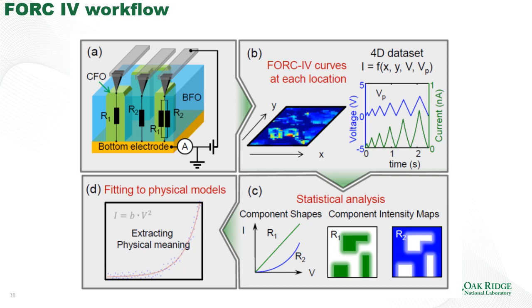So as machine learning and linear unmixing tools progress, we can do this type of analysis using more and more sophisticated machine learning tools, but that was kind of important to start.